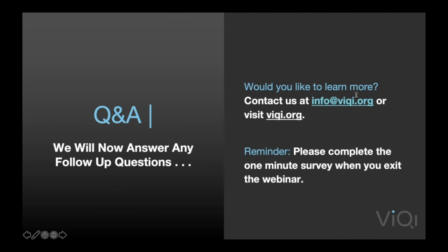You know, the way that feature-based AI distinguishes itself is the classifiers that are used. These are pretty sophisticated nonlinear algorithms that, in fact, are all the modern ones, the ones that I've mentioned. There are obviously ones that are not used these days because they are sensitive to too many features. But the answer is no. I mean, nowadays, the support vector machines, random forest, some of the distance-based methods, they're totally insensitive to the number of features. And I would say totally within reason.